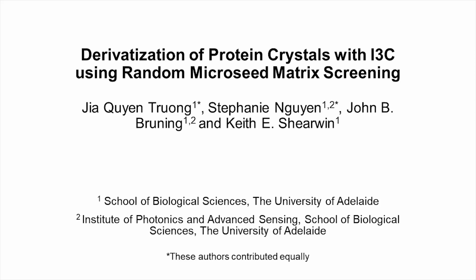This is a crystallization protocol designed to optimize the growth of a protein crystal while simultaneously derivatizing the protein with a phasing molecule to determine the structure of a protein via X-ray crystallography. To determine the X-ray crystal structure of a completely novel protein, crystallization conditions are optimized to produce quality crystals.